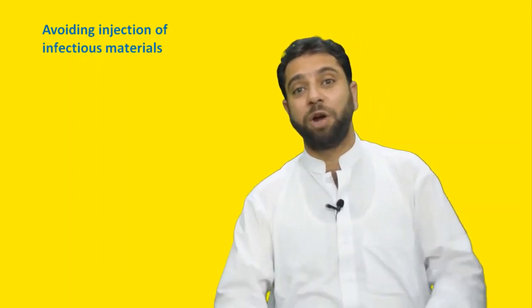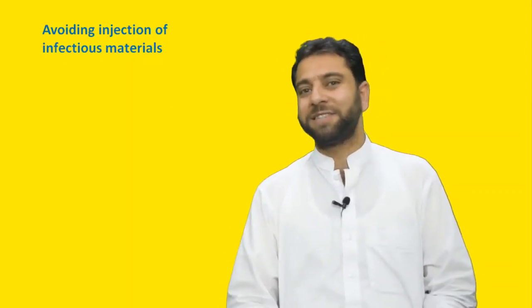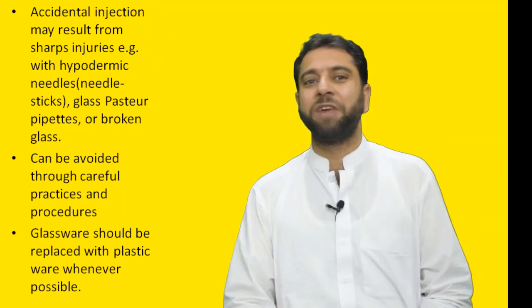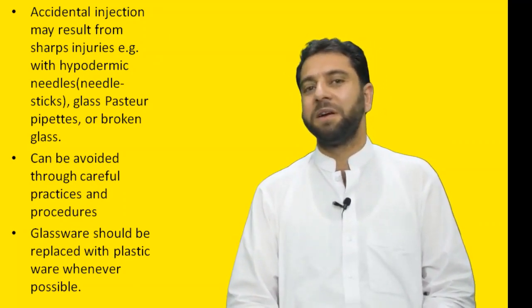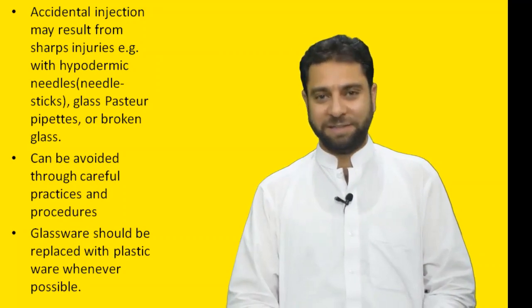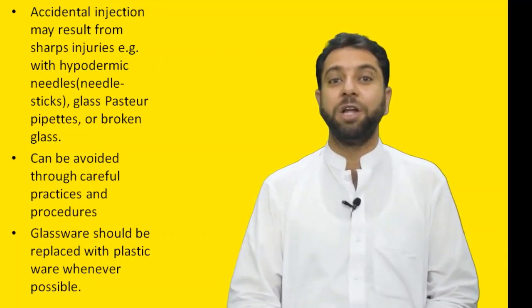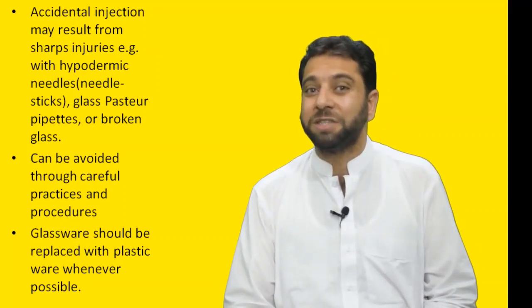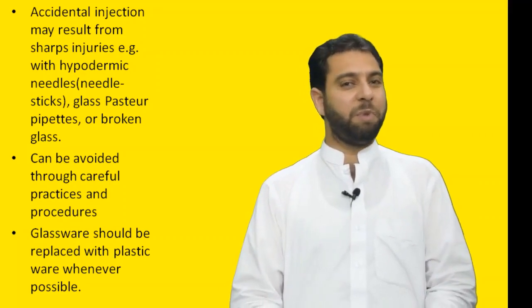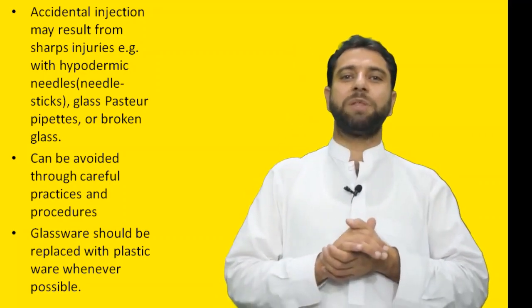Needle sticks or broken glass can injure lab workers. Such accidental injuries may inject infectious materials into lab personnel. However, injection of the infectious materials can be avoided through careful practices and procedures, and if possible, the glassware should be replaced with plasticware.